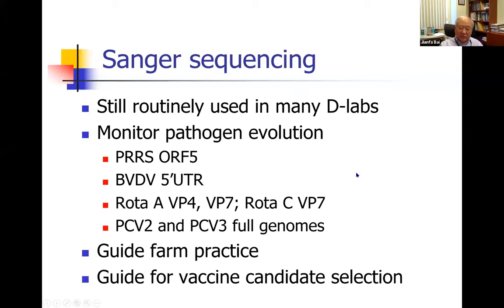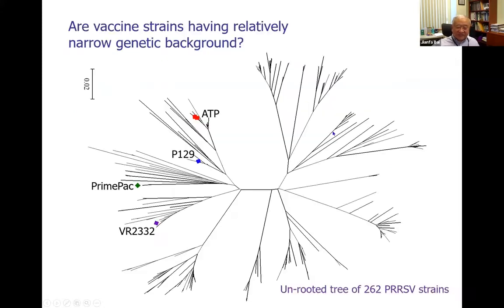The major reason is that the first generation is cheaper and faster. The second generation takes like 2 weeks practically, although you can get it done in a week, but we routinely accumulate a few samples before we run it because it's way more expensive. If we don't, then we don't make any money. So that's why first generation is still used.